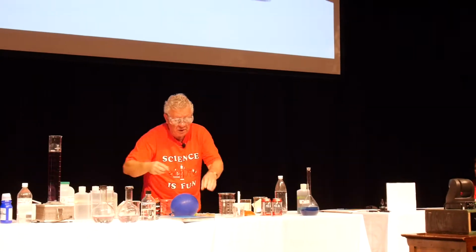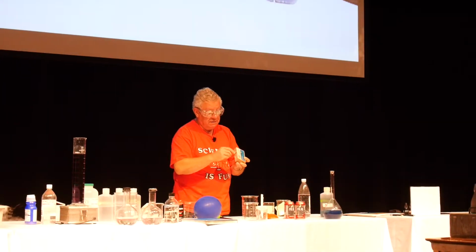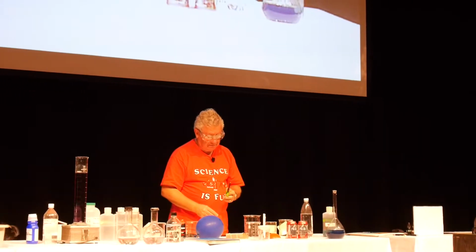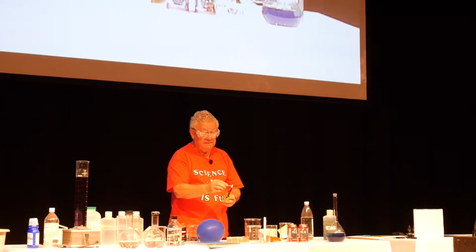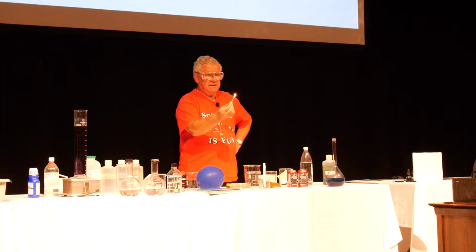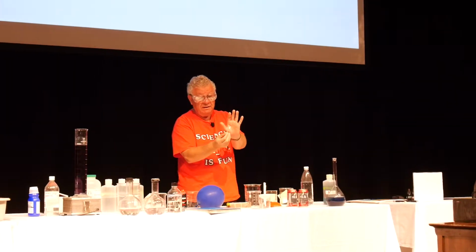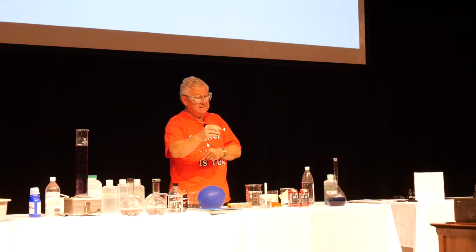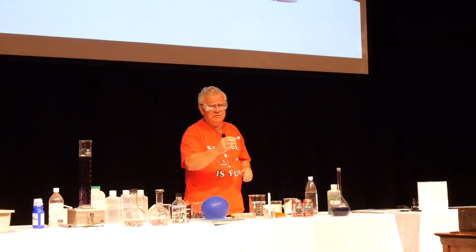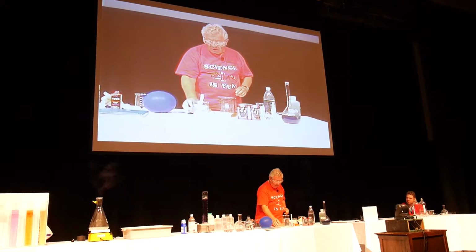Here's an example where we have the release of energy. So here's an example of a reaction that releases energy in the form of light, but also in the form of heat. In fact, I can tell you if I put my hand close by here, it is hot. And you know this from experience. This reaction releases energy only in the form of light. It's called chemiluminescence. And I should blow this out before I burn myself, right? So be careful about handling all kinds of chemicals.